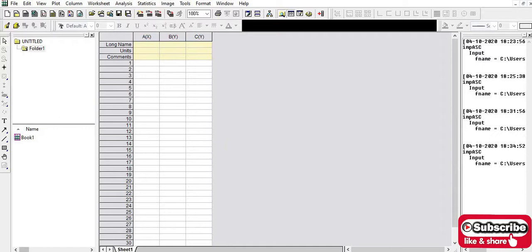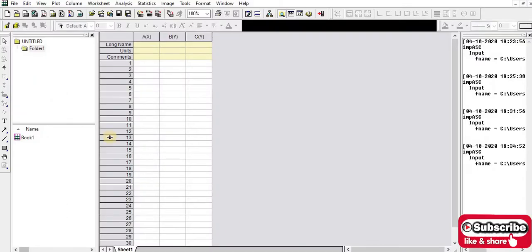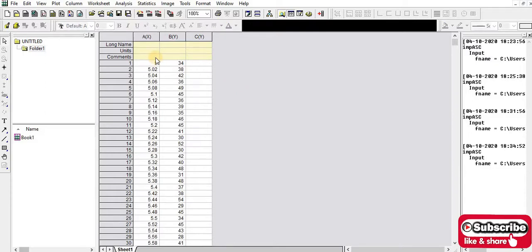So now I am going to plot one data. In an Excel sheet I have some XRD data. So I'm going to copy it and then plot this one. So Control P. Yes. So long name. This is the 2 theta and this one is intensity. So the unit, this unit is degree, so degree, and the intensity unit is arbitrary unit, so a.u. That's this. So now I'm going to plot.